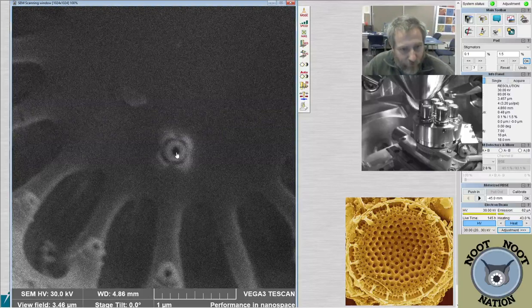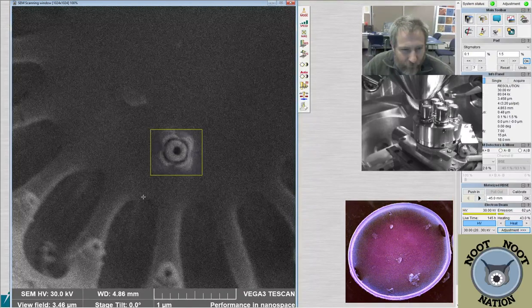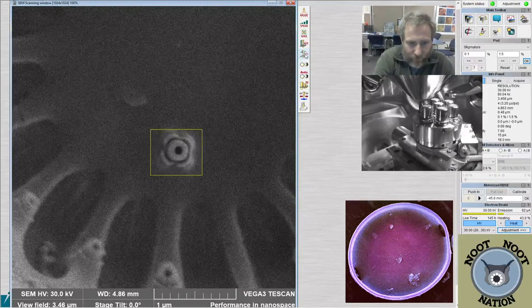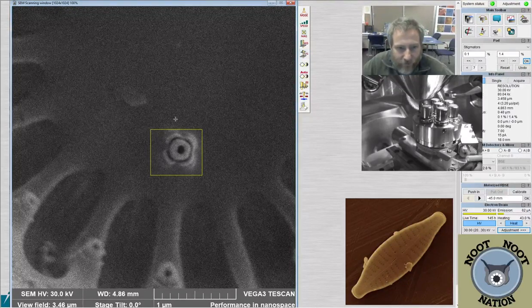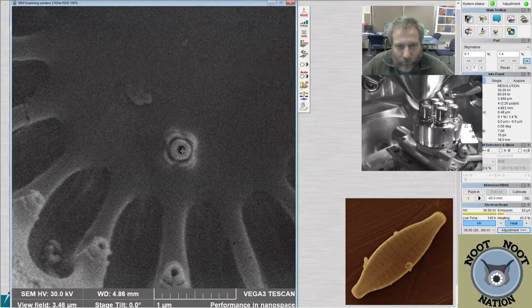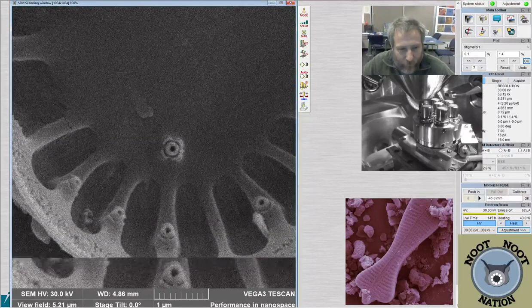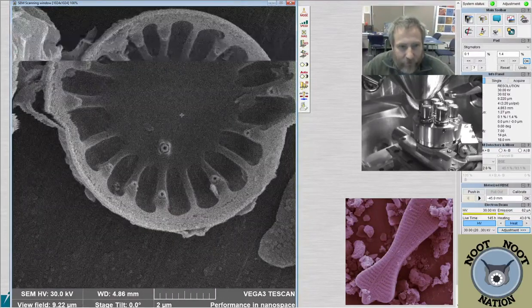It's actually got four satellite pores. The ones on the sides have either three or two, typically. But you can see that one very clearly, or you should be able to now. And I'm just going to, again, play with it a little bit to see if I can improve that image quality. When you get to the really small stuff like this, that's when things like wobble and stigmation start to really matter, when it's in this very small size range.